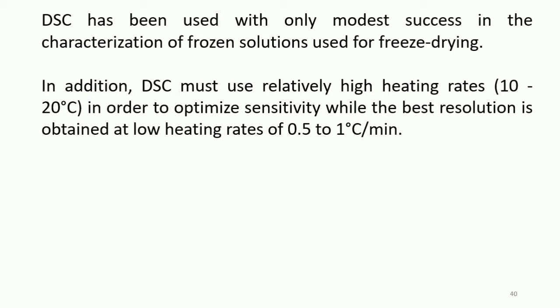Therefore, the knowledge of this structure and how it changes with time and temperature is required for successful drying.